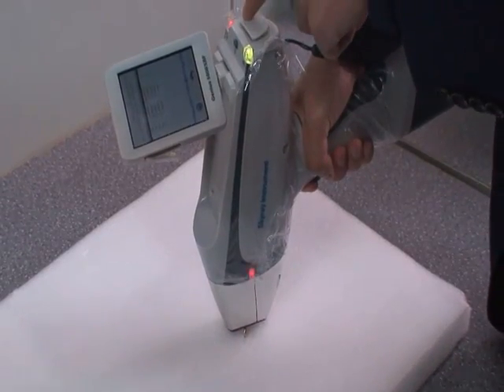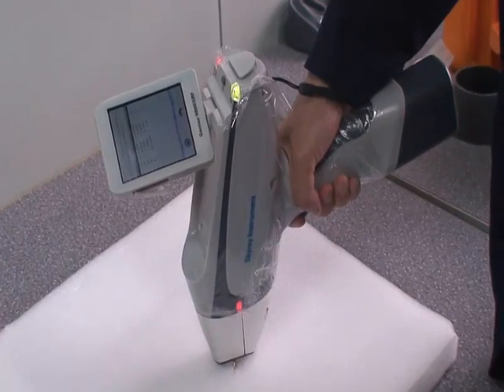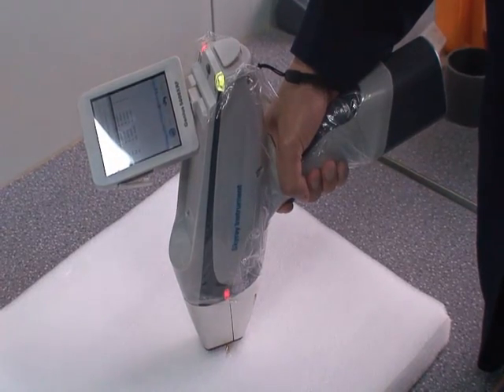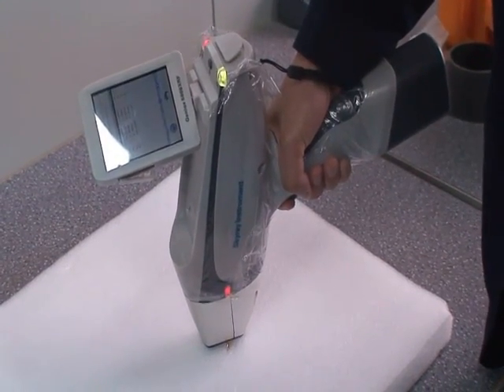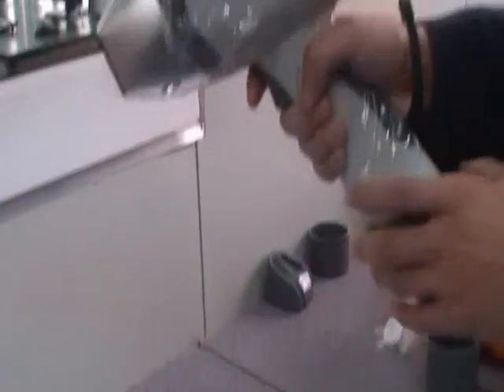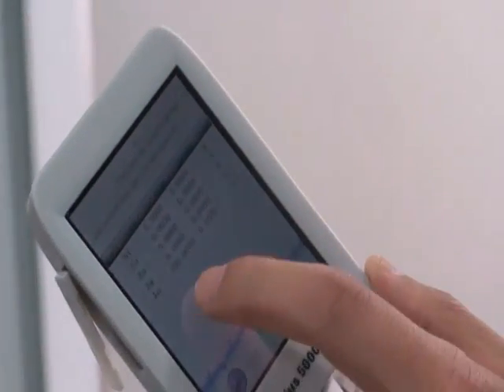Okay, now the x-ray is on. This light is right. So now we can see the result. Is it gold? 100%. It's 24 karat.